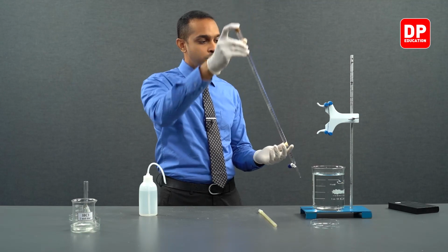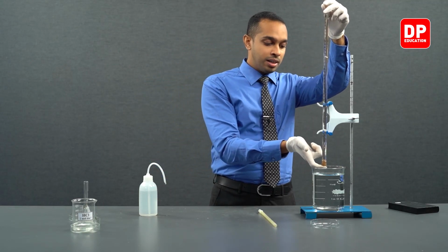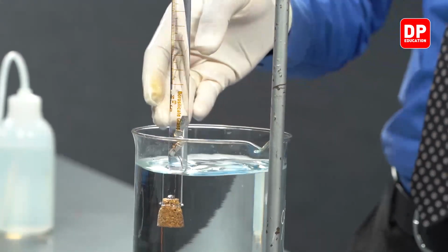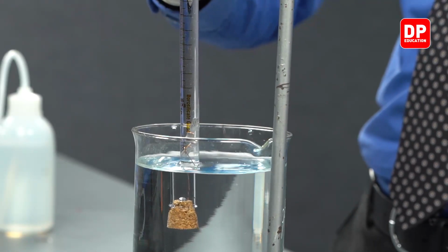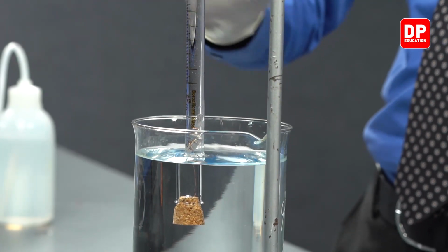We can now turn this burette, and while keeping a finger underneath the cork, we are going to place the burette inside water like this, and we will secure the burette with the help of our retort stand.